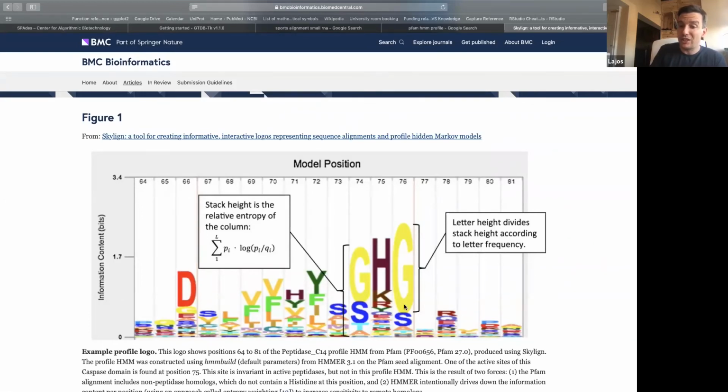So if you have a G here, that will be a very high score in finding a good hit. If you have a G here, that won't make any difference, probably in position 77, related to the final score. If you have a D in this position in 66, then it will again score as a high score contribution to similarity. But also if you don't have some kind of residue, for example here, but you have that residue in your protein, that's very against the hit.